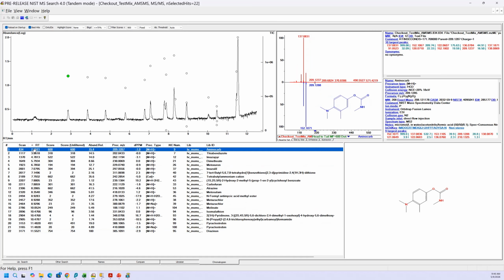And again, I can now select down this very small list to decide what I might want to include in my report. So you can essentially sort by anything that you like when you're processing your data. Another way to process it might be the things that have the highest scores. So I'll say show all, go back.